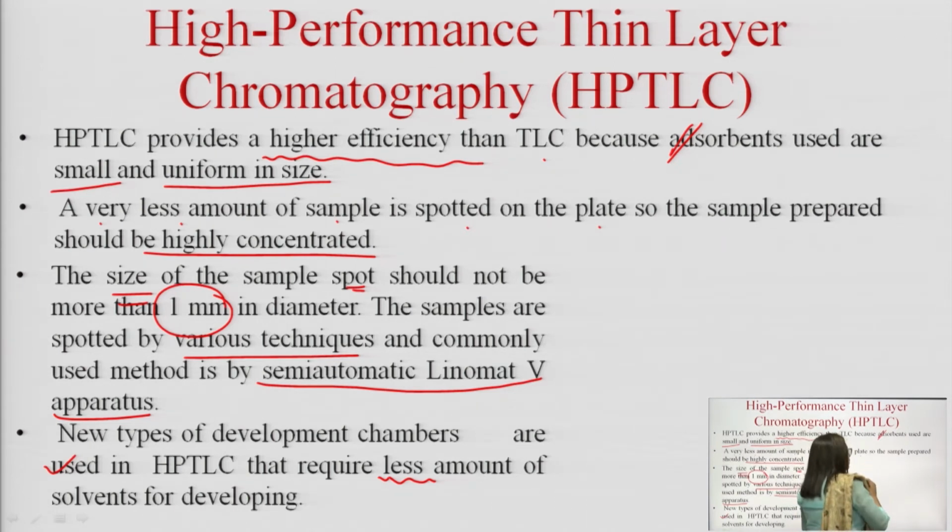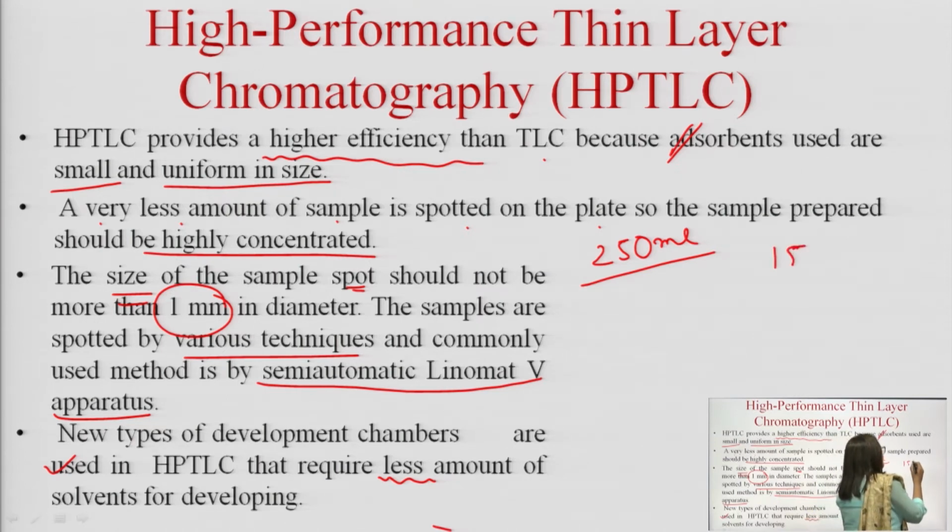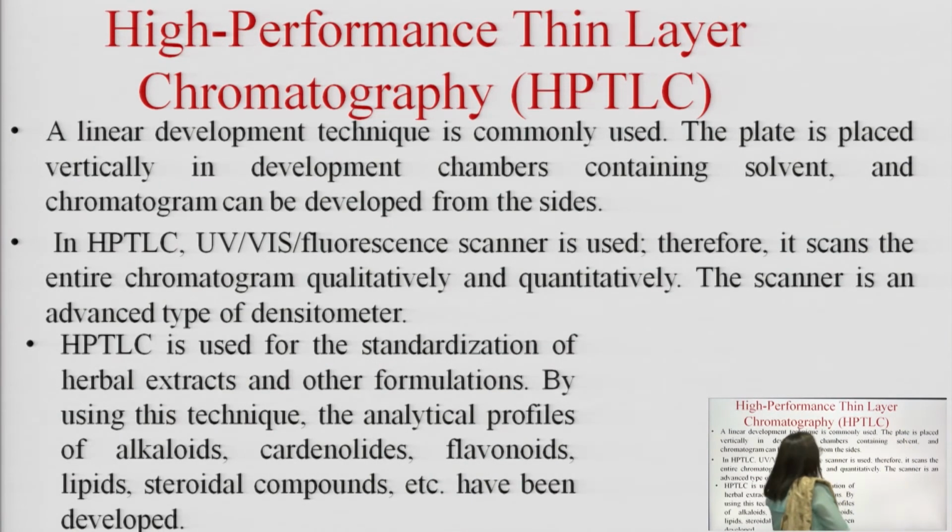Generally, in chromatography, when a 20 by 20 plate is utilized for TLC, we have to prepare a solvent system of almost 250 ml, while as compared to that in HPTLC only a 15 ml tank is available, and since the adsorbent is already available in a pre-coated plate on an aluminium sheet, the time taken for development is also reduced. So, there is a marked difference in the solvent utilized for the separation of the solutes, and hence it is a more preferred one.